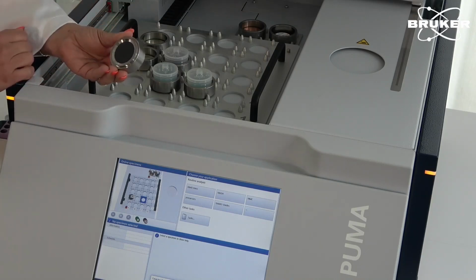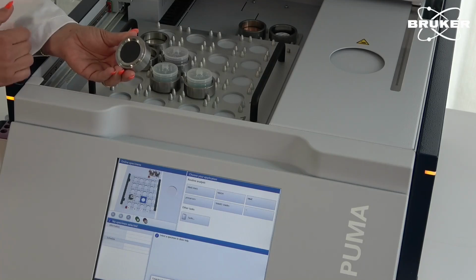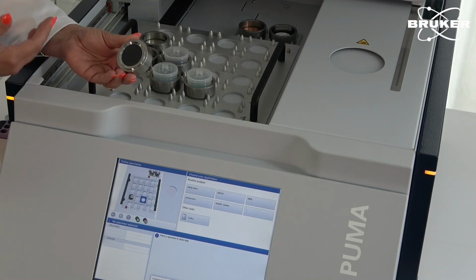In case of very light elements or low concentration of light elements, or like also fluoride, in this case, we would typically use the vacuum mode. But also for the pressed pellets, for heavy elements, you can run the samples under air mode.